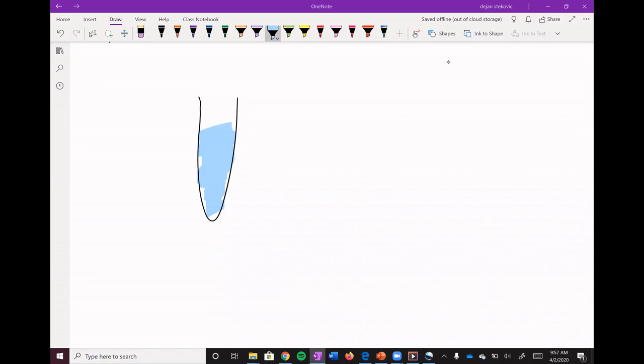All right, so as you can see in the video right now, we've got one of our solutions. We've got a solution with some liquid. It's blue here, it's clear in real life. And then we've got a solid dispersed inside of this liquid, right? It's white in real life. I drew it as black here. So how are we going to separate these two?